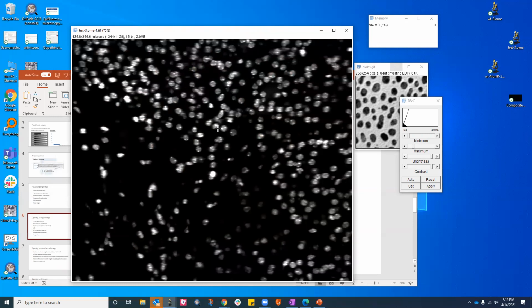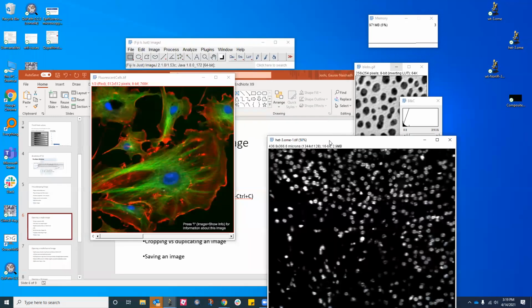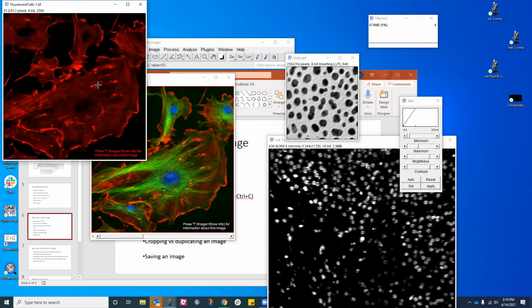All right. So this is enough to play with a few of the things I want to. And this is for you to also appreciate when we open one versus the other. And I will just open one of the images and I'll talk about everything I'm doing over here. Okay. So don't feel that I'm rushing through things. I'll discuss every single step that I'm doing.